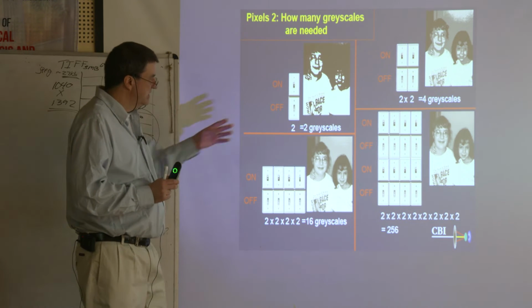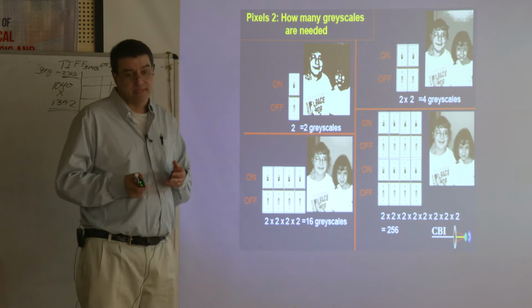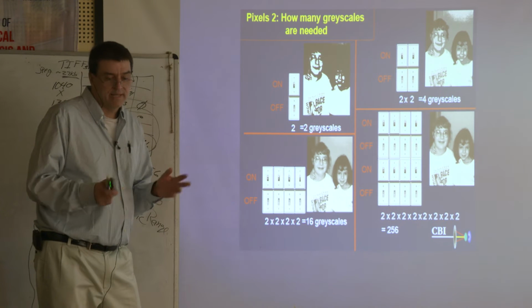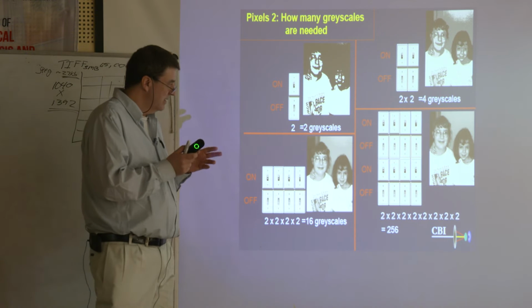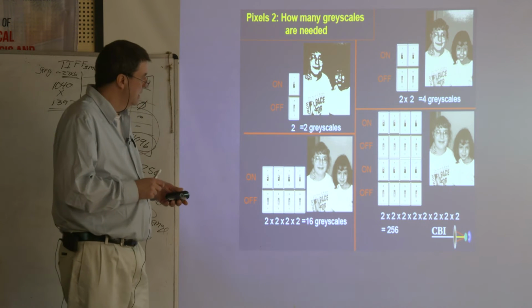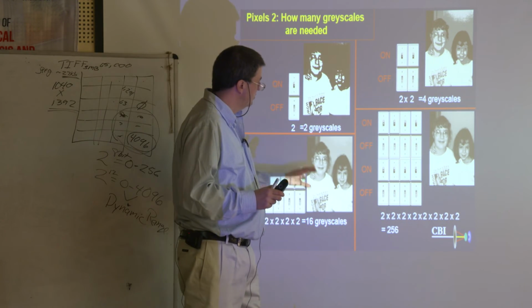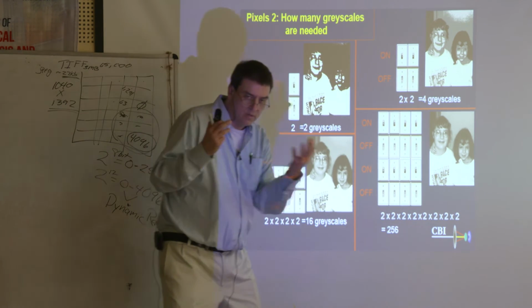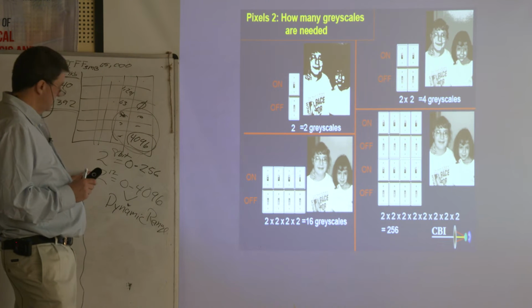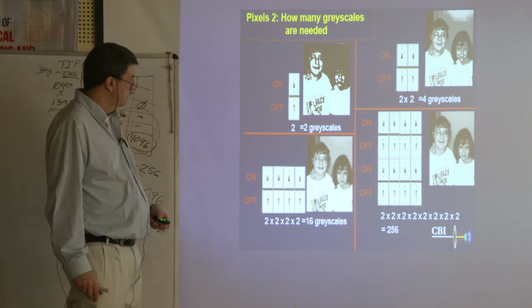So, does this idea of bit depth make sense? Because when I started selling digital cameras, I had never even heard of this concept of bit depth. So they had to sit me down and really train me to understand it, because I was now selling digital cameras for a living. I didn't understand any of this. But I think if you look at these pictures, it shows you that as you increase bit depth, you get more information out. And again, for scientific work, you've got to be at least at 12.